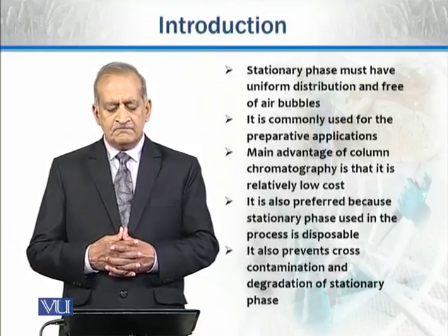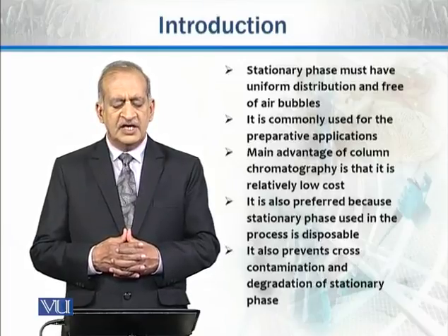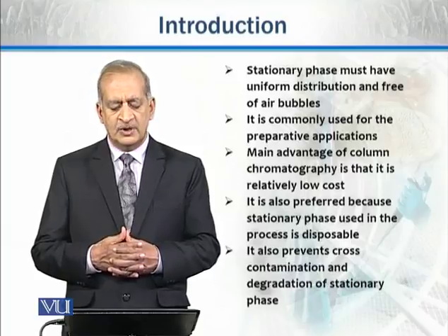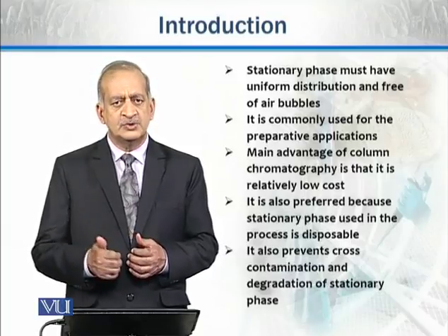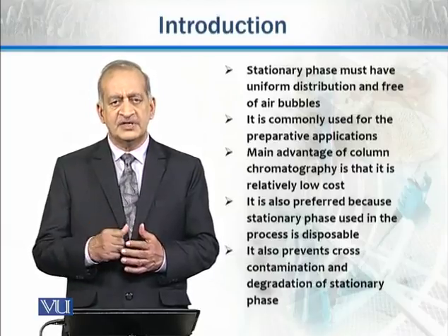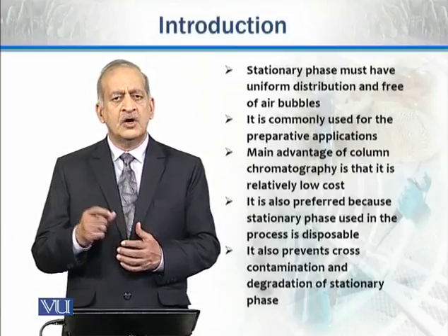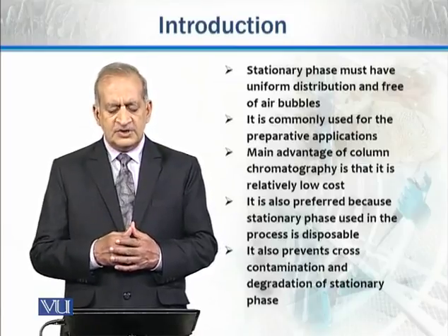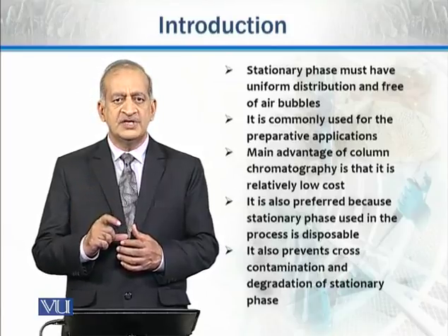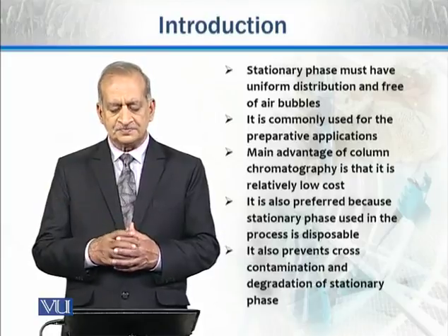The stationary phase must have uniform distribution, and it must be free of air bubbles. Obviously, since separation takes place here, it should be free of bubbles. Otherwise, interference will come into the separation process. Similarly, the distribution of the stationary phase inside the column should also be uniform. It is not that somewhere its concentration is more and somewhere less.